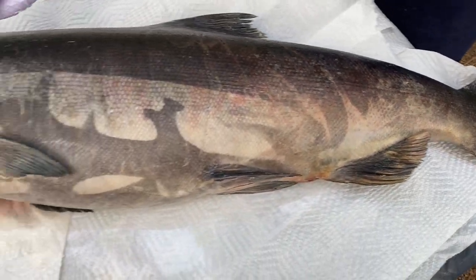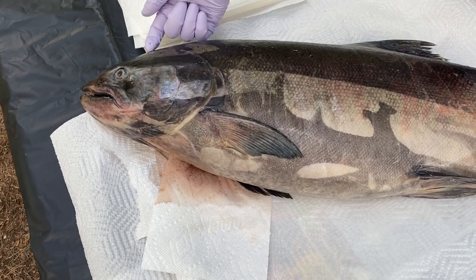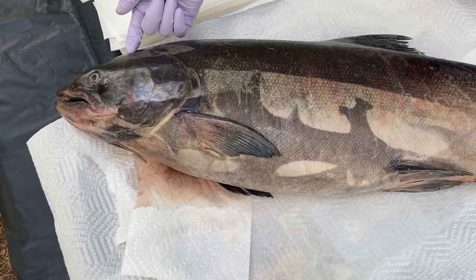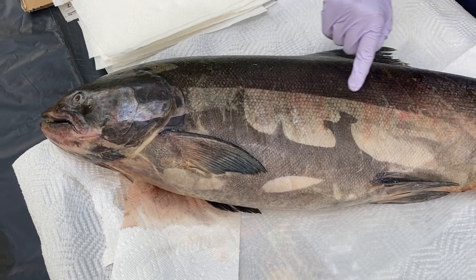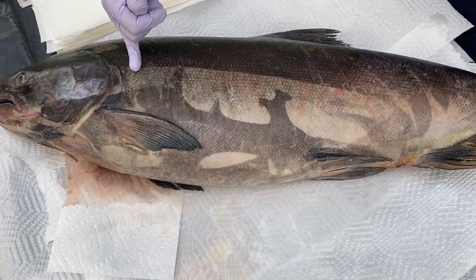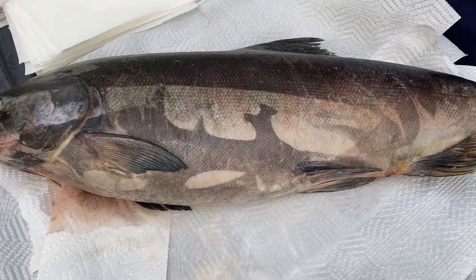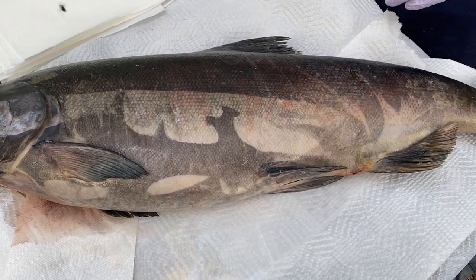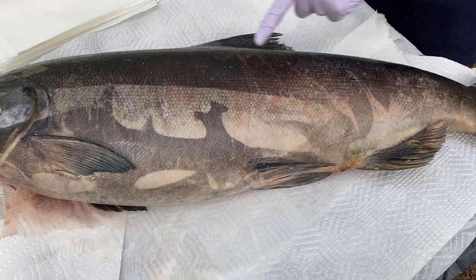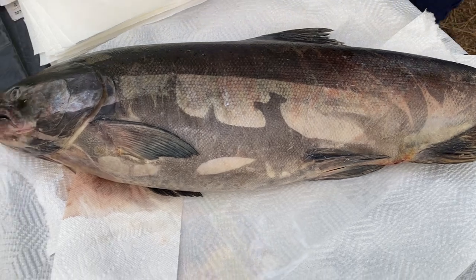And so fish, you can see they don't have ears like humans do. They don't have a hole in the side of their head. They have an inner ear that can use sound through vibrations, and they also hear sound through this line on their body. There's a whole bunch of little holes inside this line, and they can feel pressure changes in the water. So they're going to sense if something is around or near it, if there's danger, if it needs to swim away. They can sense it through vibrations, much like your eardrum works. They have a lateral line that does that same cool thing.